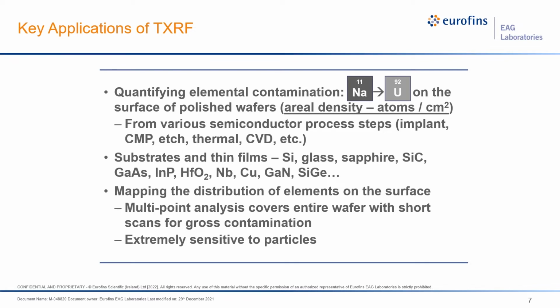Now, the biggest strength of TXRF is we have the ability to map the distribution of elements on the surface of an entire wafer. So we employ a multi-point analysis that we can select and customize and just cover either the entire surface or maybe even just characterize a wedge of a wafer. And finally, I want to point out that TXRF is extremely sensitive to particles on the surface of a wafer.